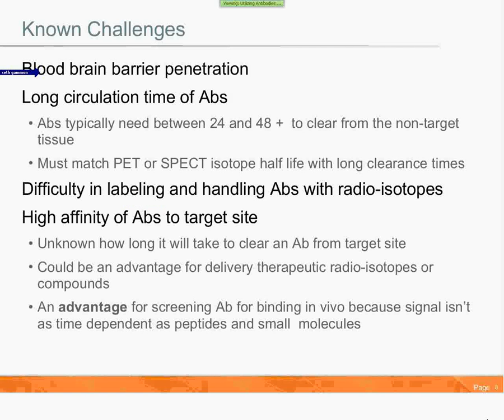Many of these challenges have been addressed in the literature and by methods that I'll show you. One is, if you don't have the facilities to utilize radiotracers, and two, again, you don't have access to them, near-infrared fluorophores offer sort of an ideal solution. One, because antibody labeling kits are readily commercially available from multiple vendors, and you can quite easily add several fluorophores onto each antibody. The other nice thing about fluorescence is there's no real analog to radioactive half-life.